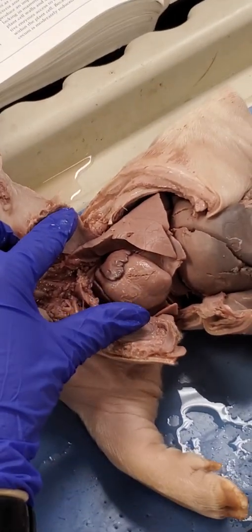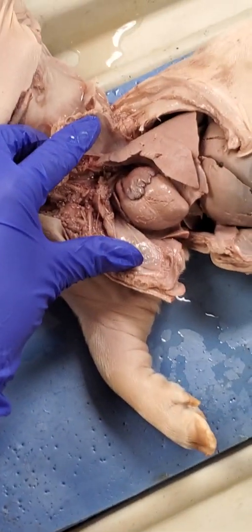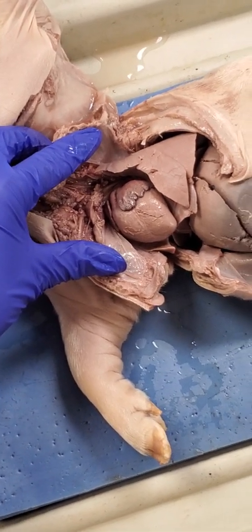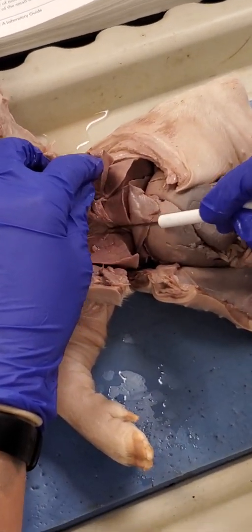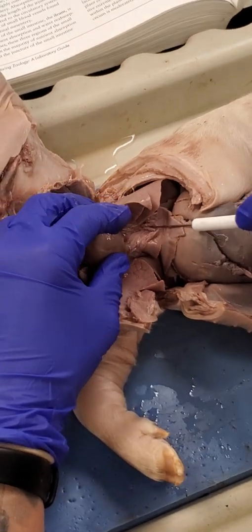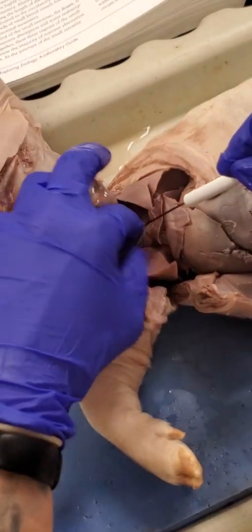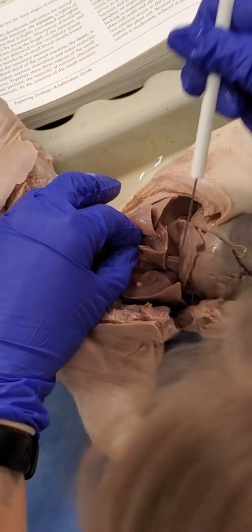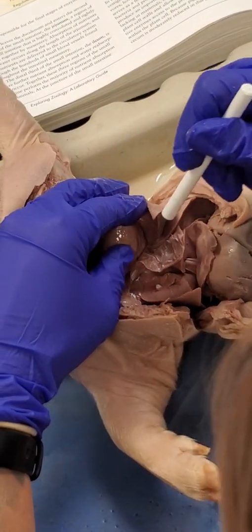Okay, and then the post cava, or the caudal vena cava. The purpose of that is it brings blood from the liver back to the heart. So that's the main blood vessel at the bottom of the heart, and you can sometimes track it from the liver back over here. Can you guys see this section? And again, see this connective tissue that we had to cut through? It's basically going to come from down here, from the liver, and then back up into the heart.